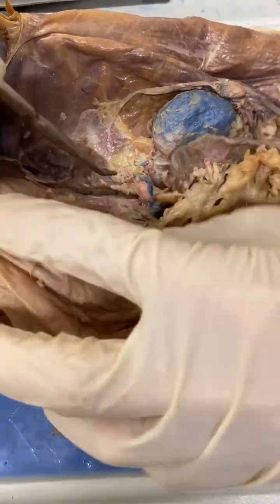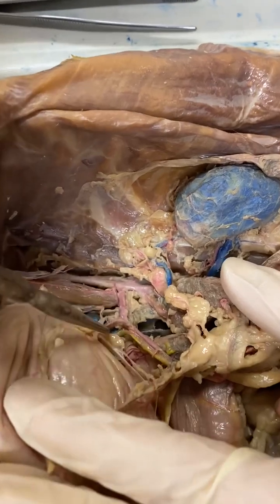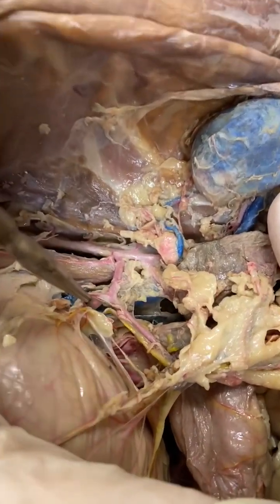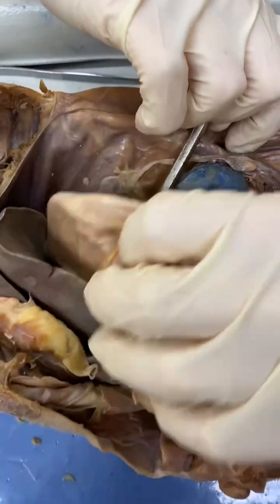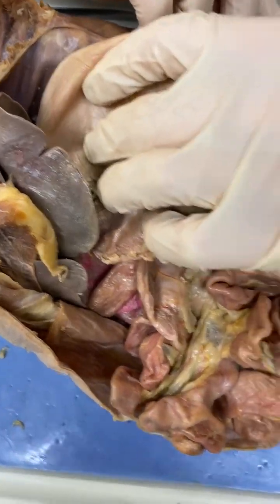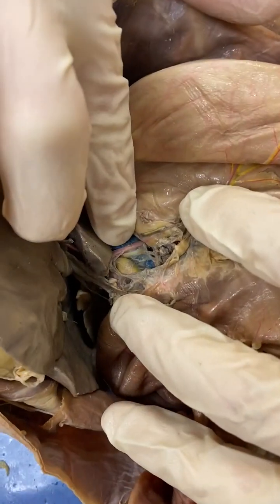Hepatic artery. The hepatic artery is deep to the left gastric, down in there. You have the gastric artery. We don't have a gastric, but we also have the continuation of the hepatic. You can see it right in there.